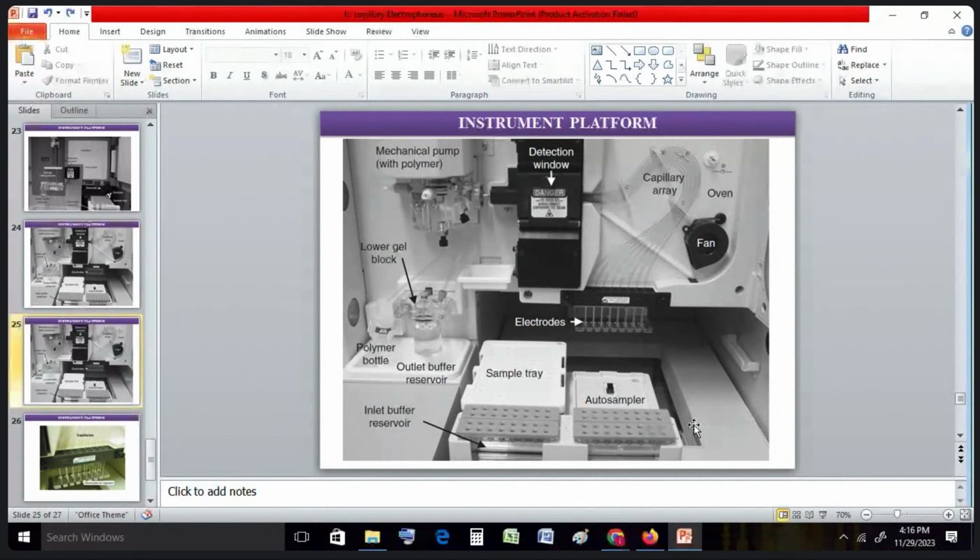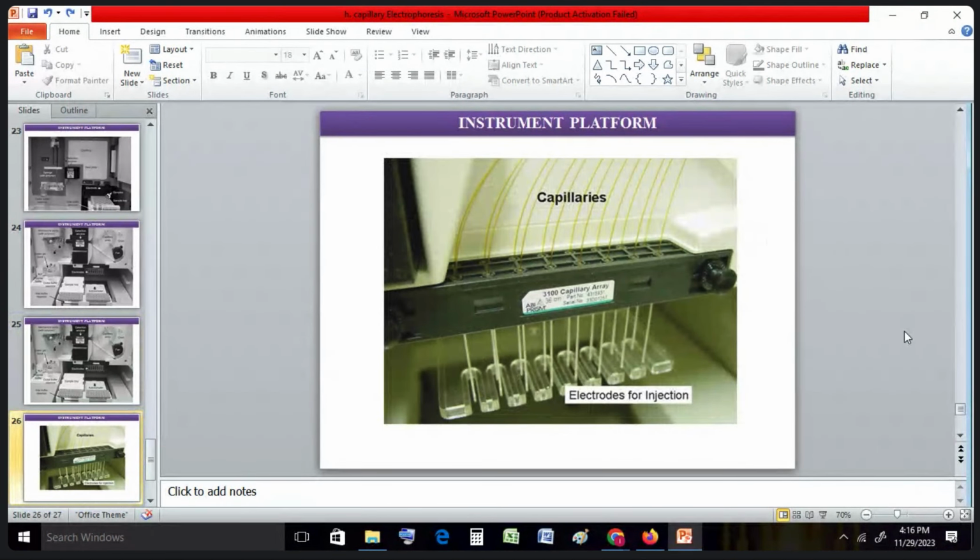বোঝা গেল এটা যে the more capillary মানে বেশি capillary থাকলে you can run fast, তাড়াতাড়ি শেষ করতে হবে। যেমন ধরো this one 8 capillary machine. I think it's 16 capillary. দেখো খেয়াল করো, each of these needles contains 2 capillaries, 1 2 3 4 5 6 7 8 9 10, yeah, 16 capillary. So it must be very quick, and we have a 24 capillary machine.